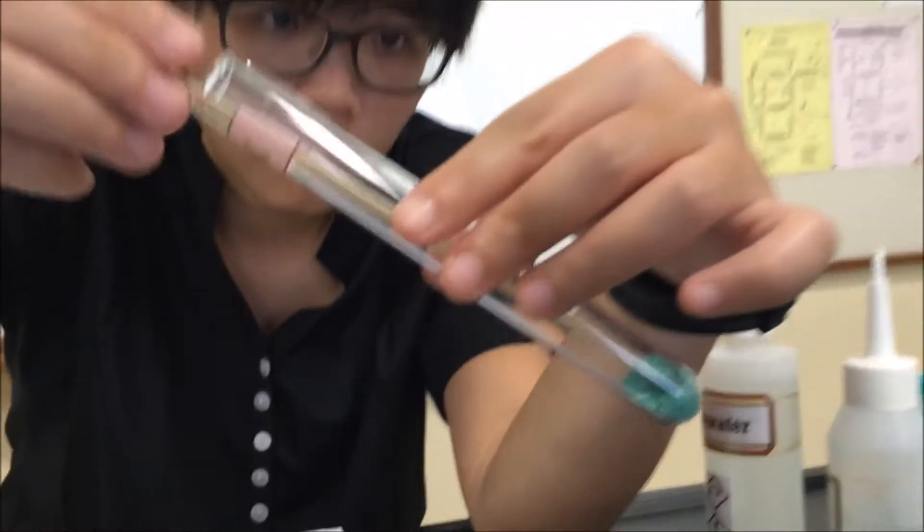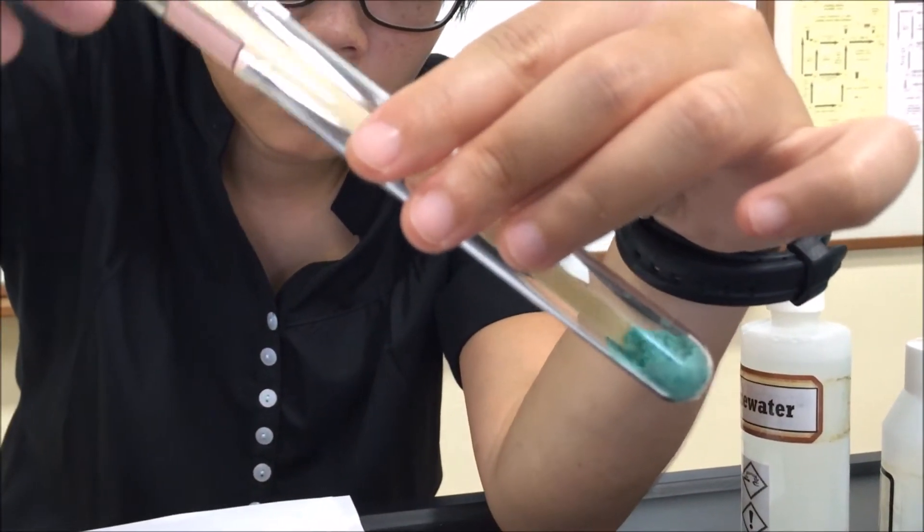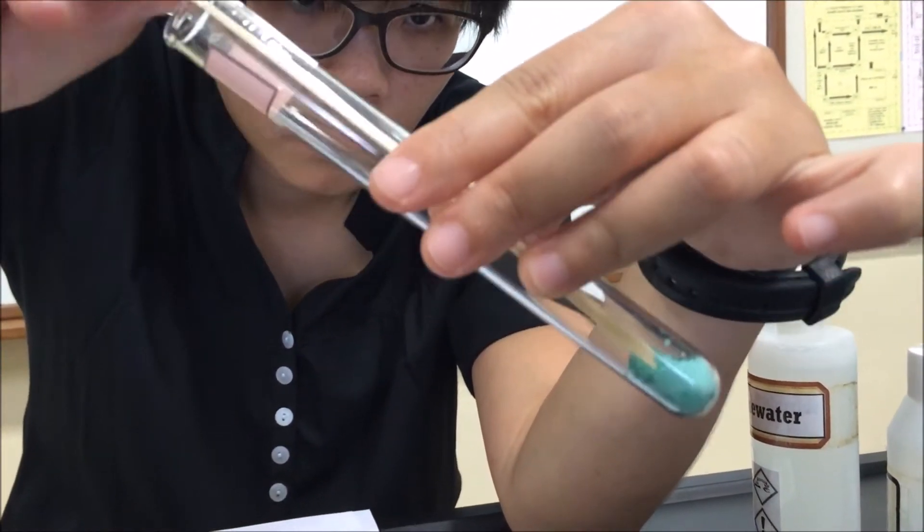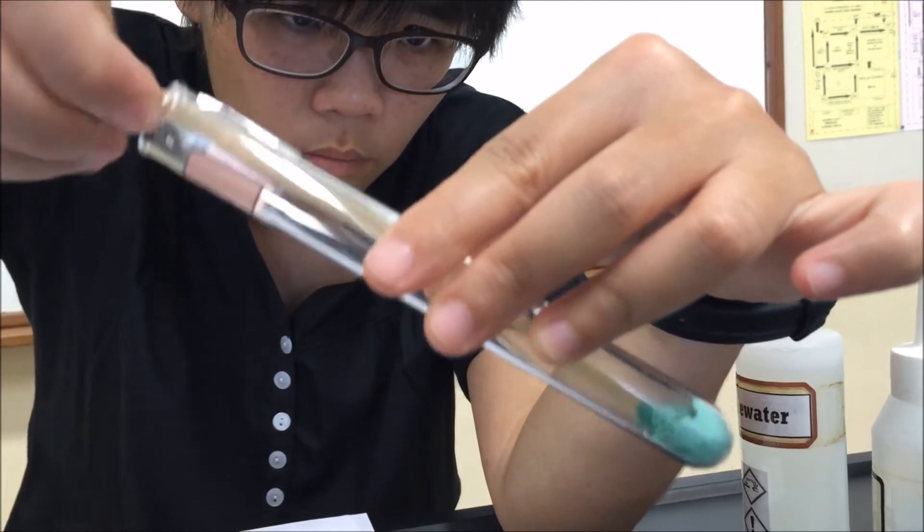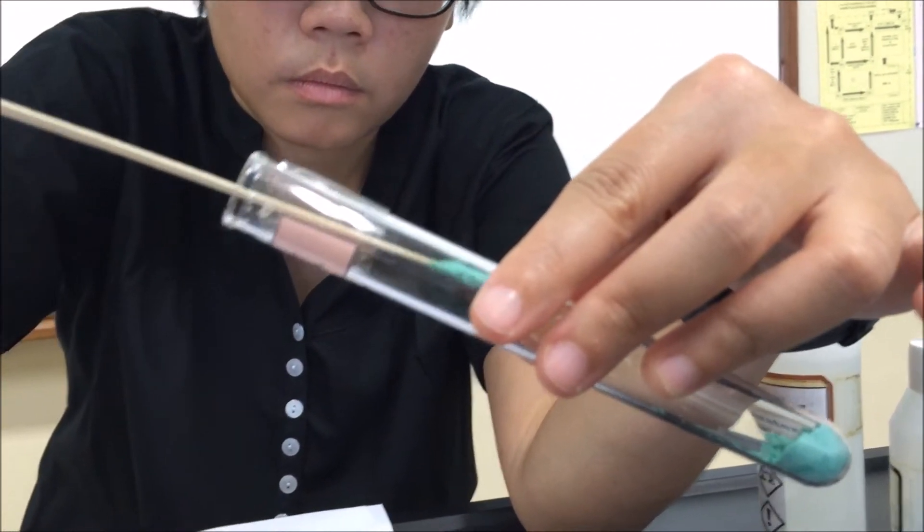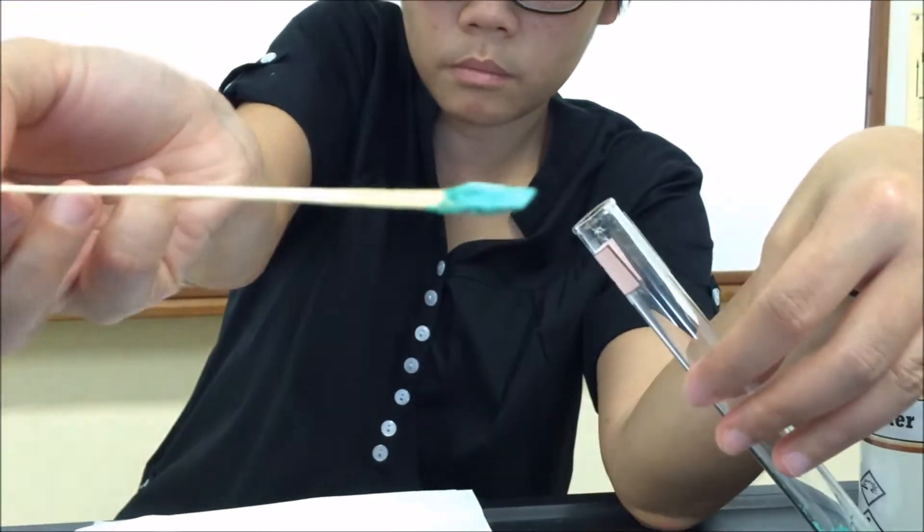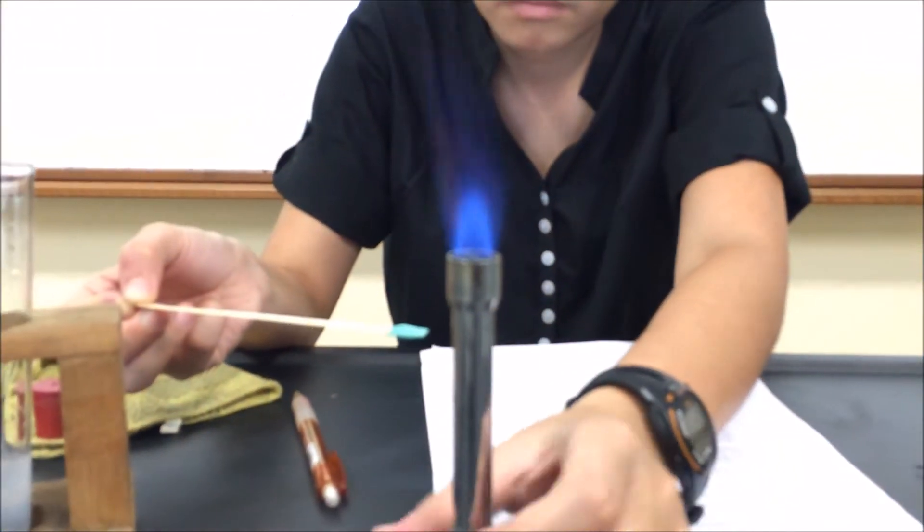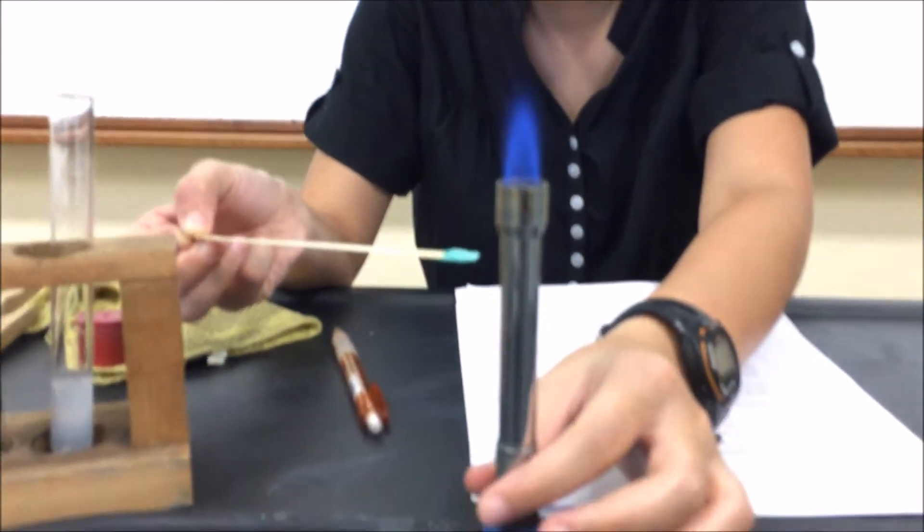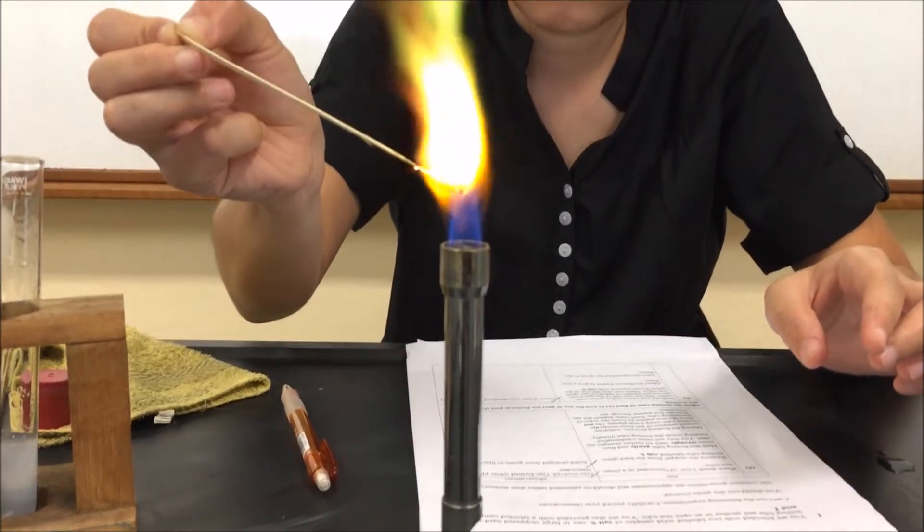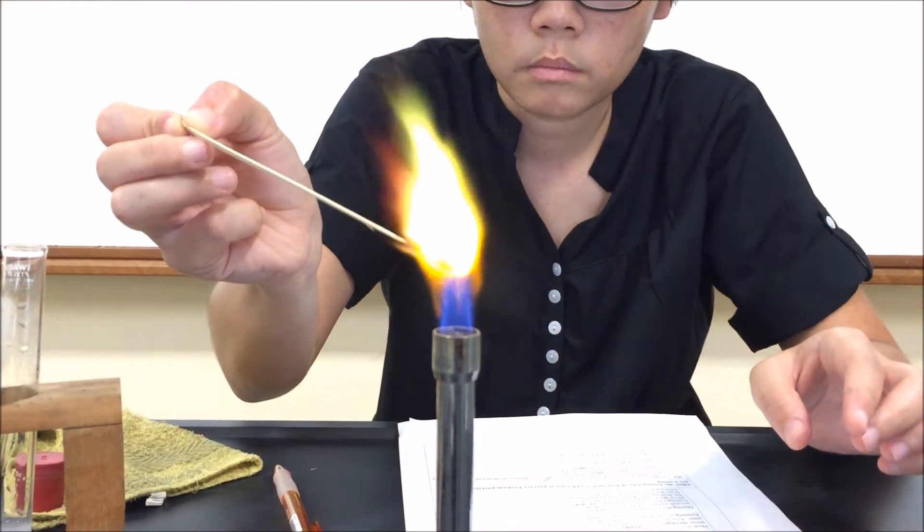And then to carry out the flame test correctly, always open the air hole to get a non-luminous flame, the blue flame, and put the splint at the top of the small blue triangle, the hottest part of the flame. So you put it in for about 1-2 seconds. And then you will see the color. So in this case, we get a green color. You can repeat a few times just to confirm.